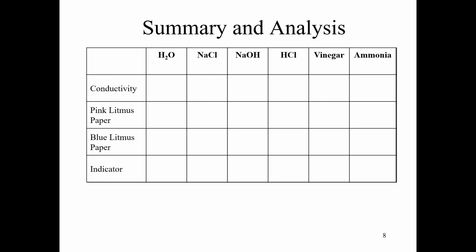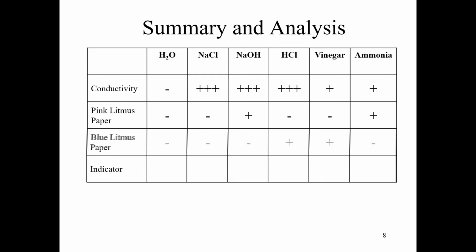And if you were willing to indulge me in this, here are the results. This is what we obtained. You'll notice that in some cases I used multiple plus signs to indicate that there was a more marked reaction than with the other ones. So let's start out with the first test here, the test of conductivity.